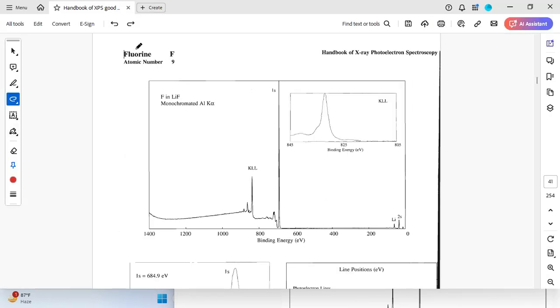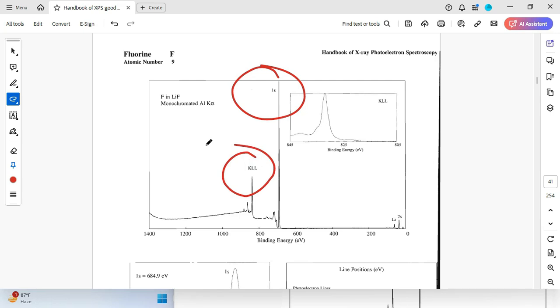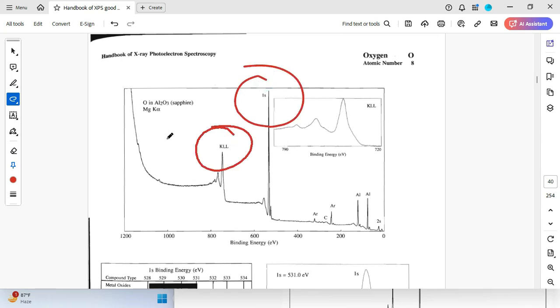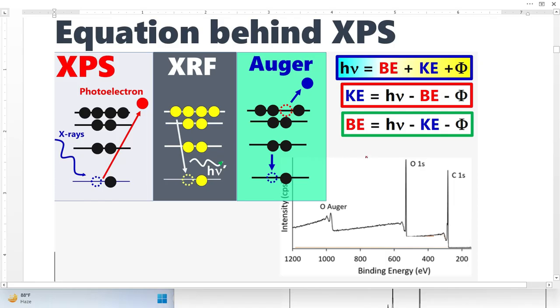Look at the XPS spectra for fluorine — there is a peak from photoelectrons and a peak from Auger electrons. Similarly, the XPS spectra for oxygen show a peak from photoelectrons and a peak from Auger electrons.